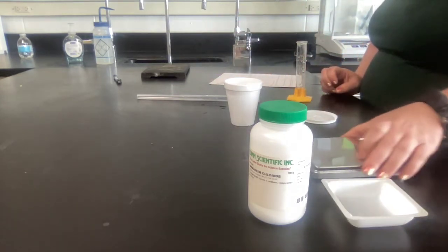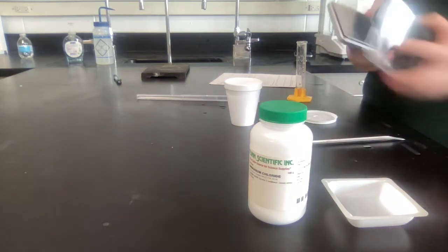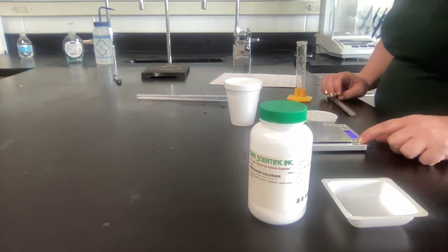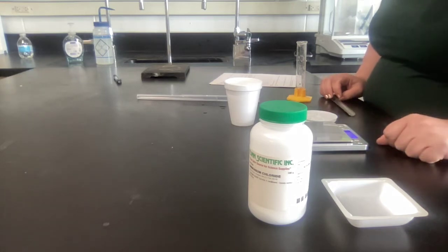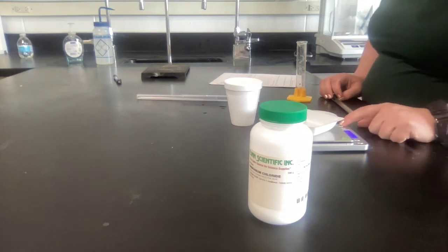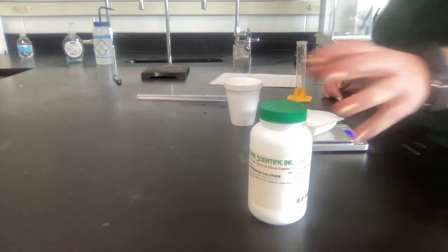You're then going to mass out between 1.5 and 2.5 grams. Turn on your balance, put your weigh boat on there, hit the T button to tare it, which just means to zero it.